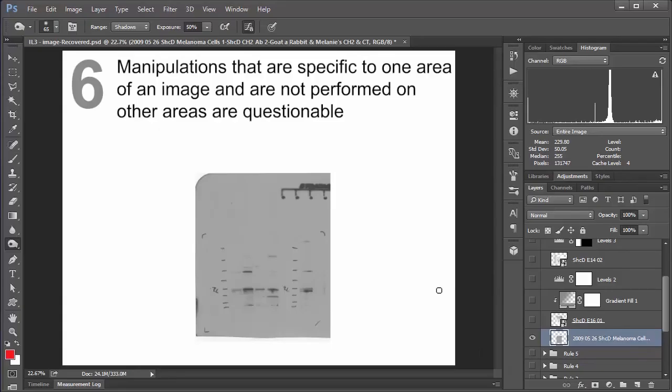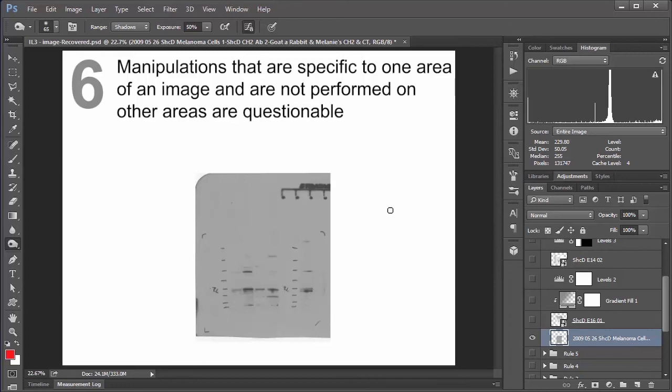Last but not least, number six. Manipulations that are specific to one area of an image and are not performed on other areas are questionable. So in his article, Mr. Cromey states that one time where this might be acceptable is if you have a 16-bit grayscale image, for example, and you have features at both the low and the high end of the image that are pretty much imperceptible to the human eye. In that case, if you want to go ahead and bump them up so that your viewer can see what's going on, that's okay. You just have to specifically mention in your figure legends that you've gone ahead and done that. So everything's transparent.